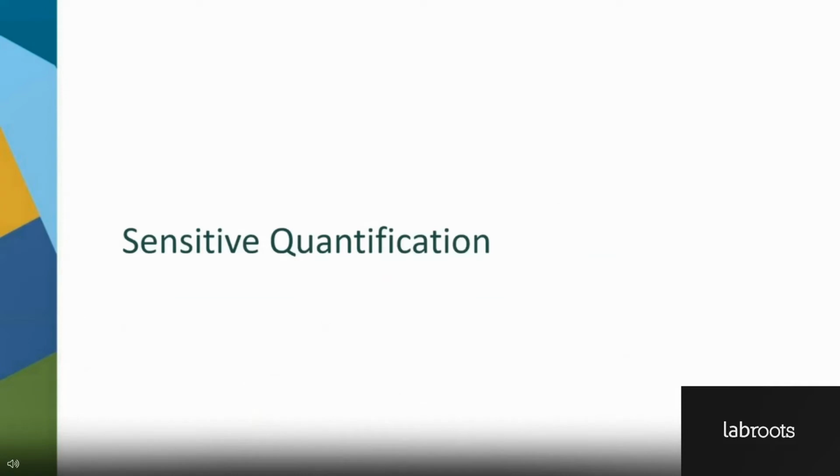Besides absolute quantification, the AbsoluteQ system can provide sensitive quantification, and I'm going to show you some examples that we have completed in the lab.